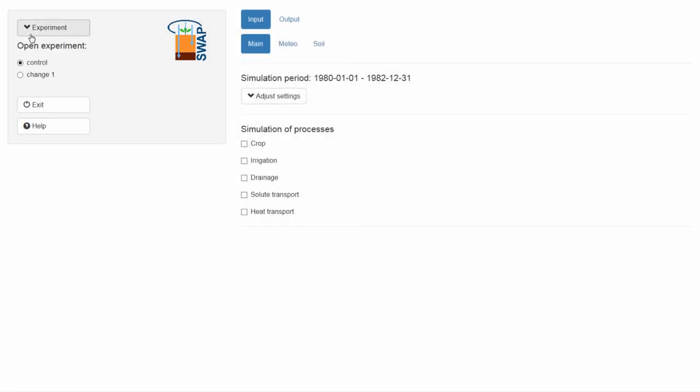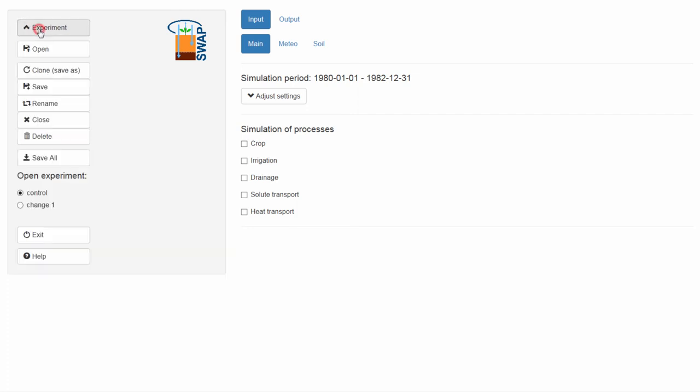The drop-down menu, Experiment, has other buttons that are mostly self-explanatory. However, I would like to explain the difference between the buttons Close and Delete.